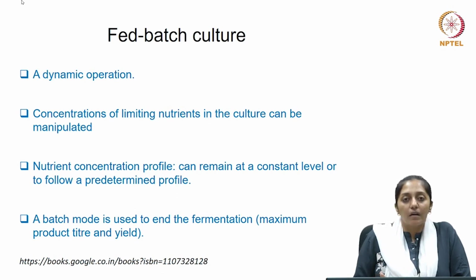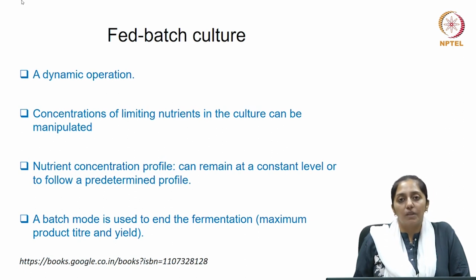Sometimes if it is pulse feeding, then one can even continue to run again after the maximum volume has been reached, running the reactor as a batch in order to ensure that any residual nutrient due to the inlet feed remaining inside the reactor also gets utilized.